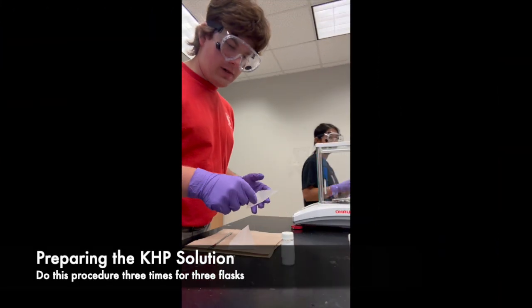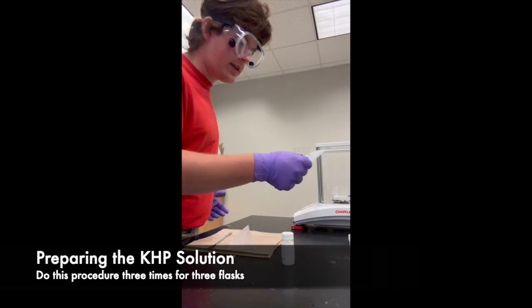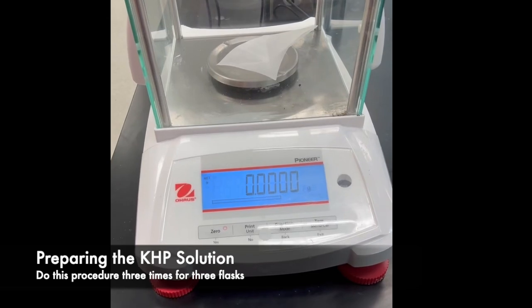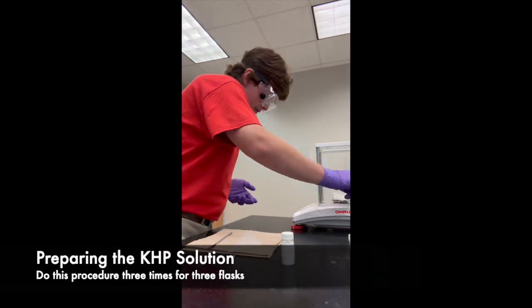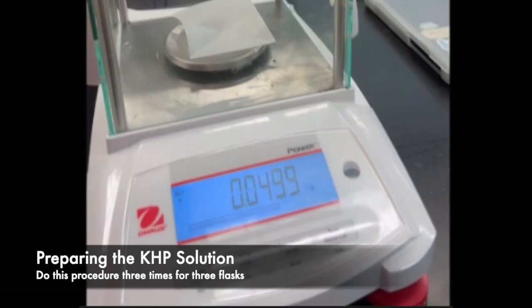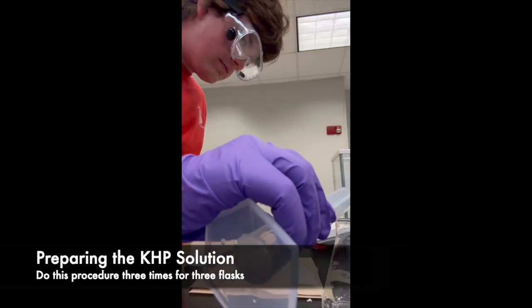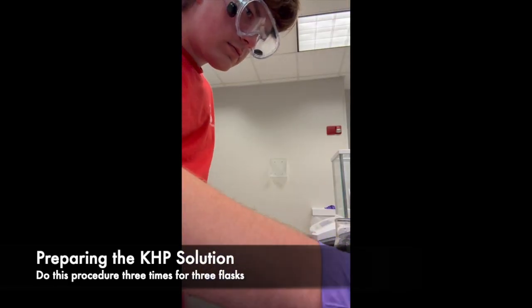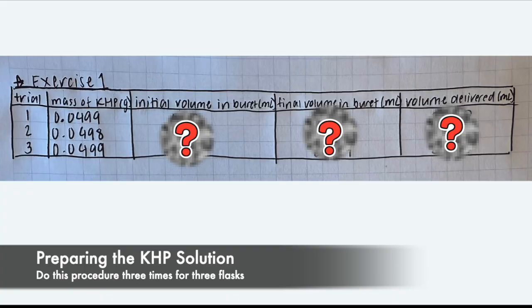We need a solution of potassium hydrogen phthalate, better known as KHP. First, we zero out the scale with the weigh paper. Accurately weigh a 0.05 gram sample of KHP and dissolve it in 30 milliliters of water in a flask. We will need 3 flasks of this KHP solution. The KHP solution is our known solution for standardizing the NaOH. This is the mass of KHP in the 3 flasks.